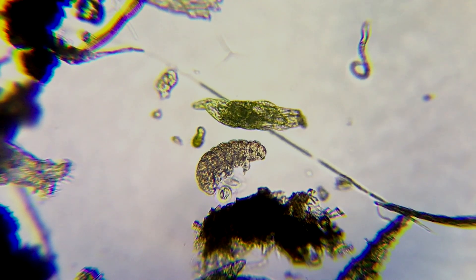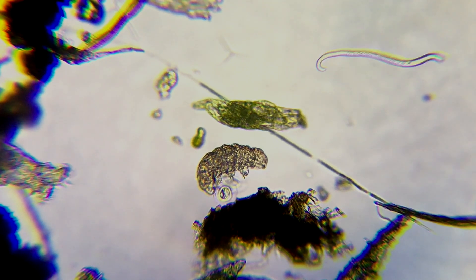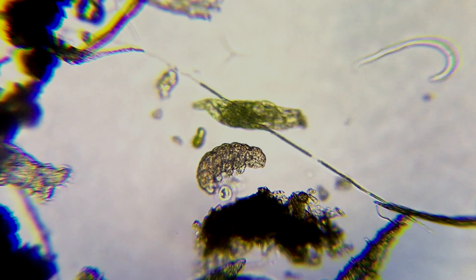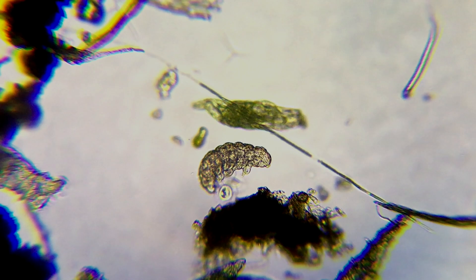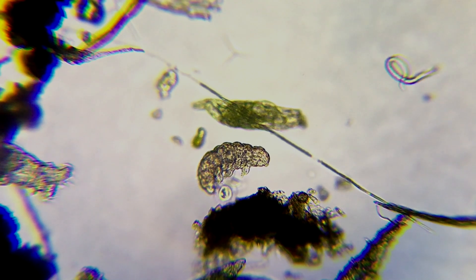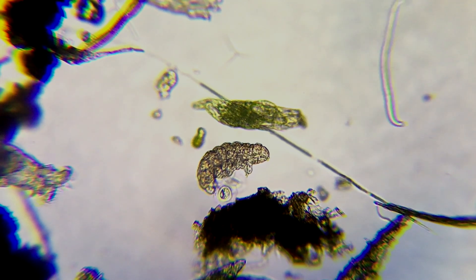Up to the top right of the tardigrade. At the start of this footage before we edited it, the nematode was hitting the tardigrade, but it didn't look any different from what it's doing right now — it didn't look slowed down at all. It was just really cool how strong they are. Nematodes are just always moving quickly — they never calm down when they're on the slide.